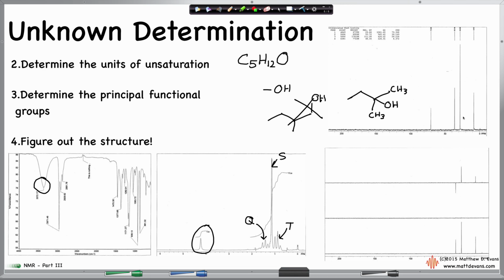Now, let's confirm that there's 4 carbon signals, but what type of carbon are they? How many hydrogens are attached? This is going to be a CH2 right here. This one is going to be a CH3, and then this one's going to be a CH3. We normally don't integrate carbon signals, but a lot of the time the signal's bigger for 2 CH3s versus just 1, and that seems consistent, so everything is hunky-dory. Meanwhile, we're missing this one right here, which is not present anywhere down here. So that must mean that it corresponds to this carbon with no hydrogens attached, so that seems pretty consistent.